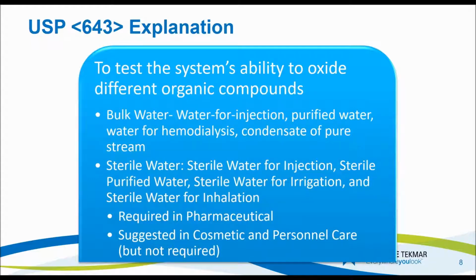It's suggested in other FDA industries like cosmetic and personal care, and I have seen an uptick in people using TOC instruments in cosmetic and personal care industries. Again, that's a good way to check and make sure that water that you're starting off with is very clean, free of bacteria, free of contaminants, or anything else that could harm a consumer.